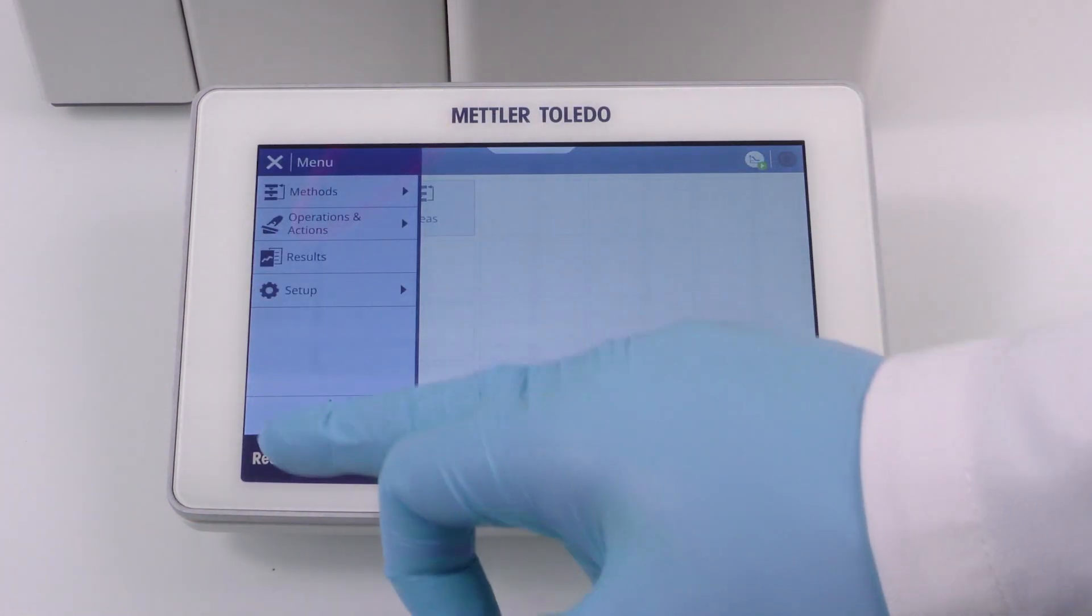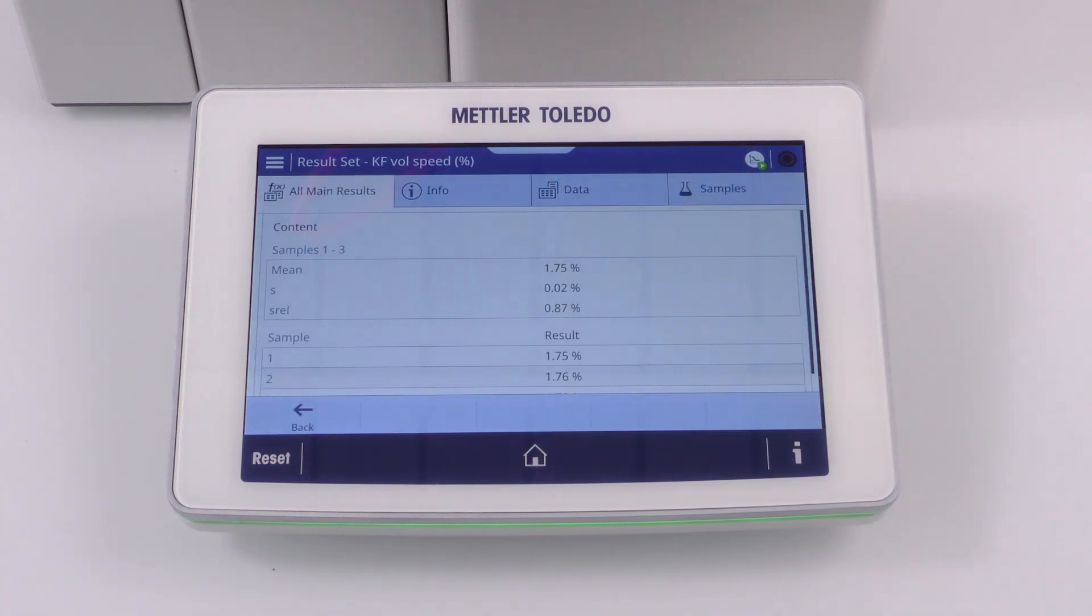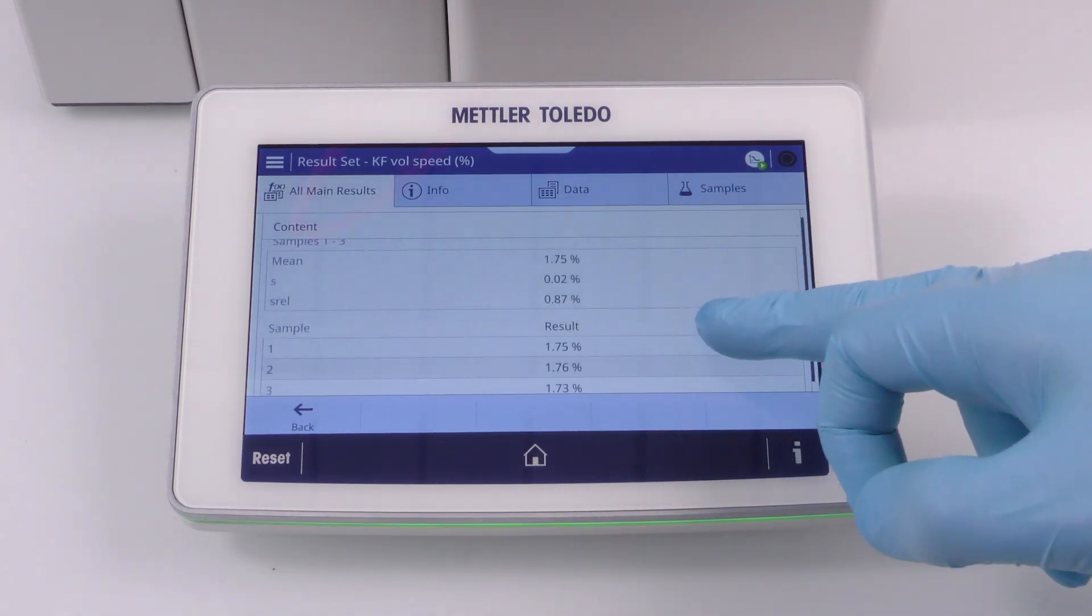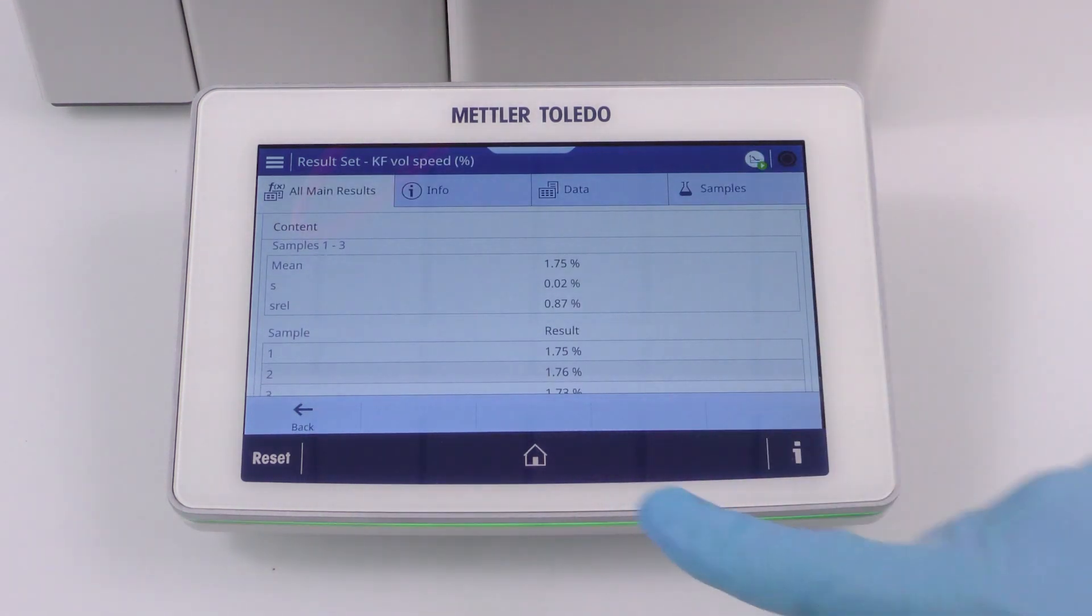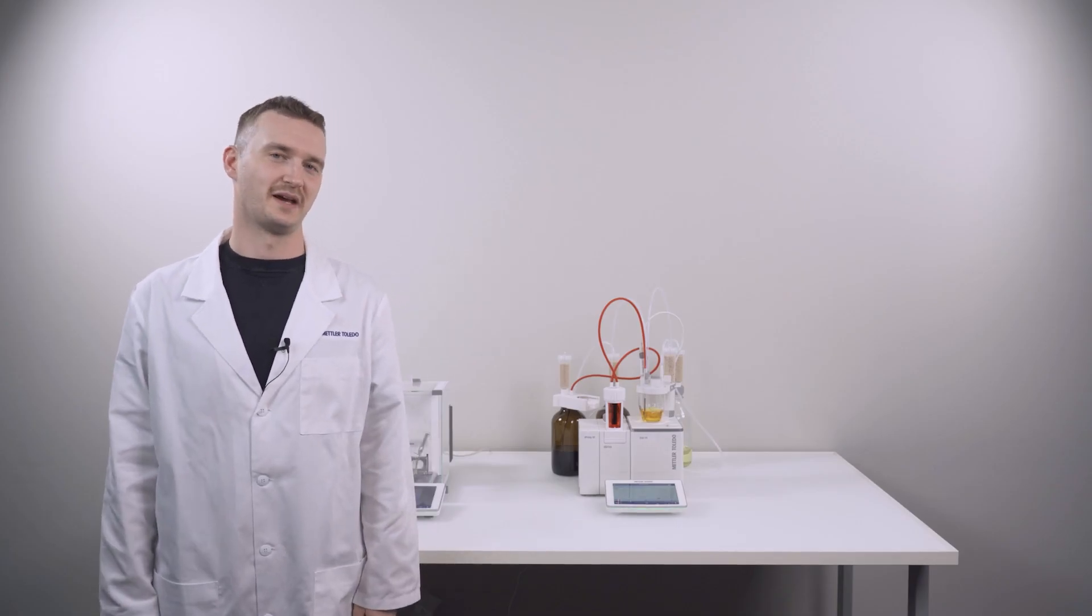The mean and all the statistics of the result set can be found under results. The water content of our industrial ethanol is measured to be 1.75%, which is quite feasible. And that's how easy and fast we can obtain reliable results with our EVA Karl Fischer titrator.